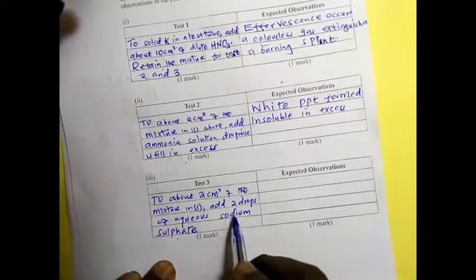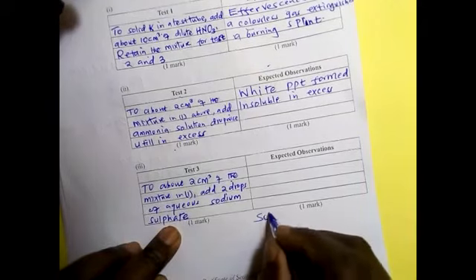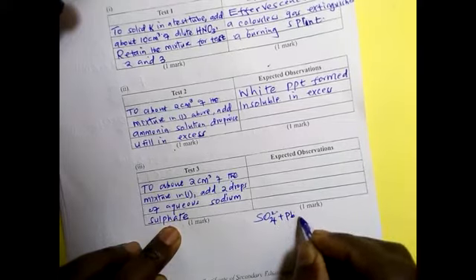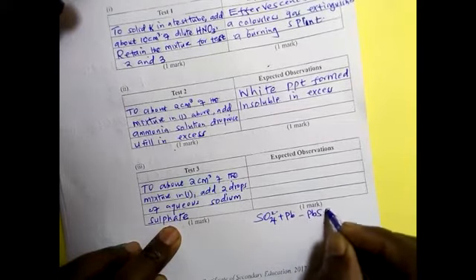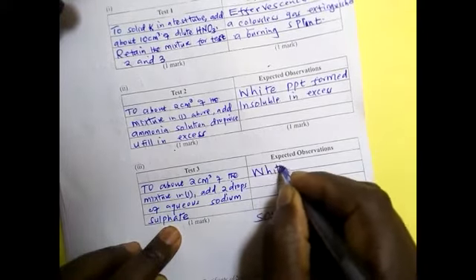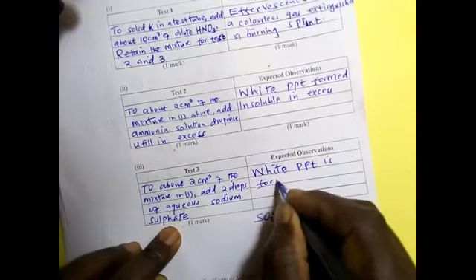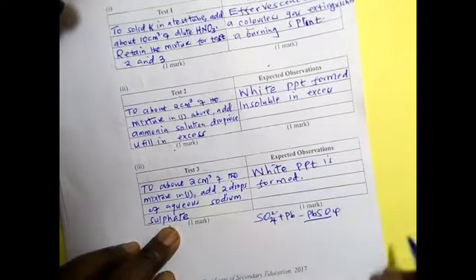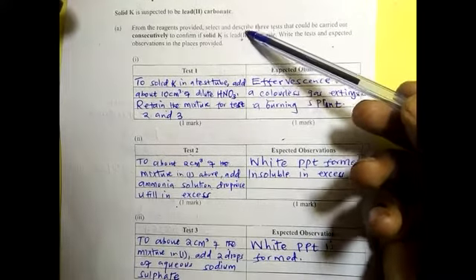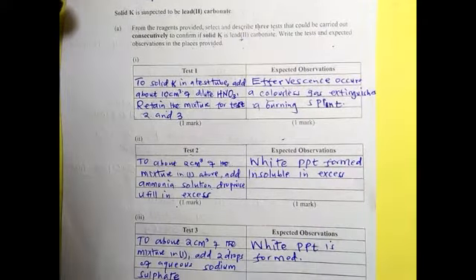We are adding sodium sulfate. We expect that the sulfate will combine with lead to form lead sulfate. Therefore, here you are expected to write a white precipitate. White PPT is formed. Now, up to that point, you have confirmed that this one could be actually lead carbonate.